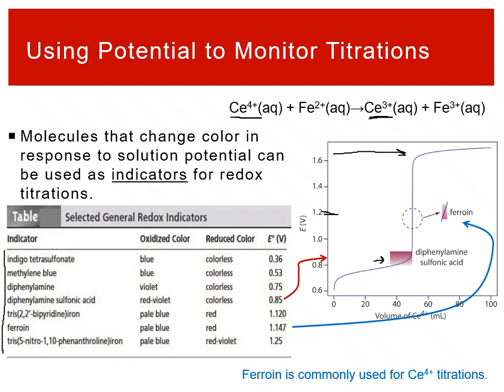Are you going to monitor potential? Are you going to monitor the color of your manganese? Do you need an indicator? There's all sorts of things going on that you need to know the answer to, but they also offer different variables that you can change to engineer. So there's a lot of flexibility. I don't expect you to memorize all this stuff, but just know that these sorts of flavors are there, these sorts of complications as well as opportunities to design the exact experiment that you want, or need, rather.